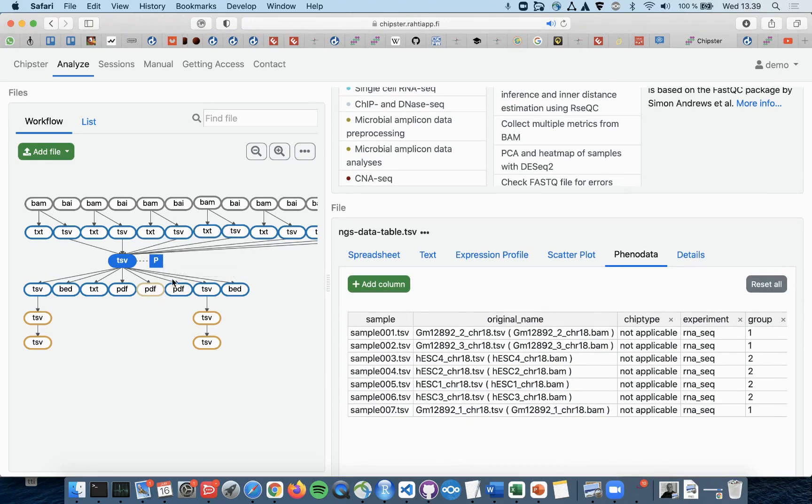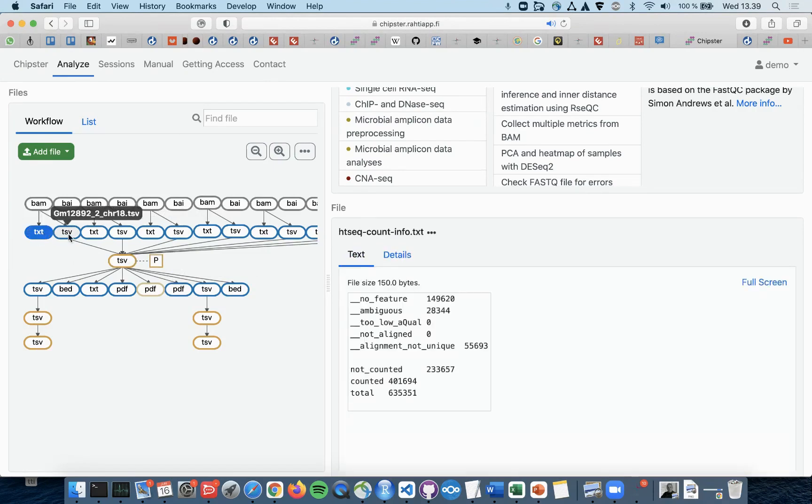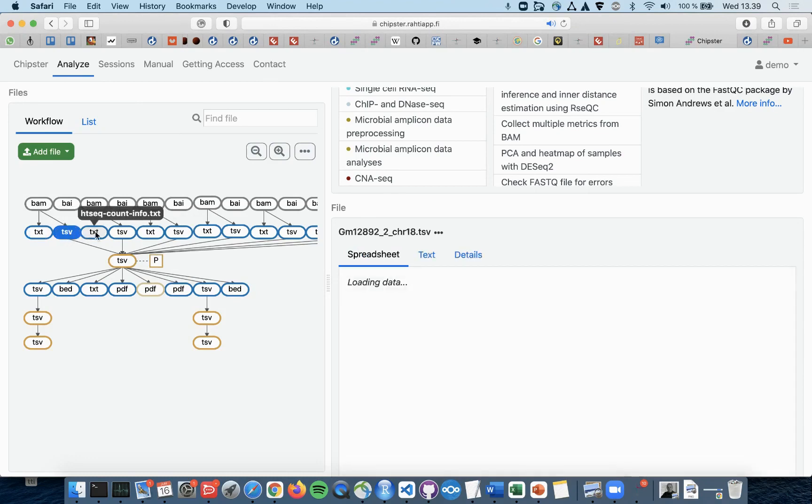In our course example sessions, we often start from very raw data such as BAM or FASTQ files. In these cases, we end up having one count file in TSV format for each sample.